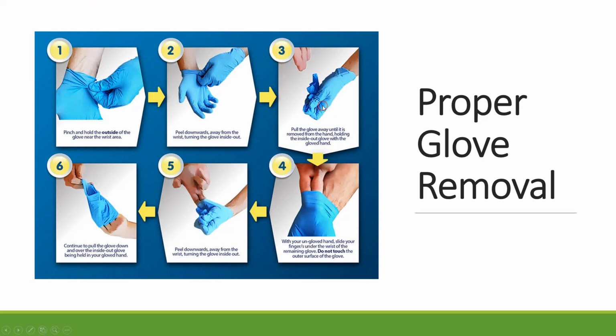But now you have one gloved hand and one bare hand, so how do you do that? Notice here that the fingers go on the inside of the glove, where the contaminant should not have been because it's inside. It's going to flip it down. Notice the hand is holding the contaminated glove, so when you flip it down and flip it inside out, the clean side of the glove is out and inside the glove is the other contaminated glove. And therefore we're able to keep all the contamination contained.